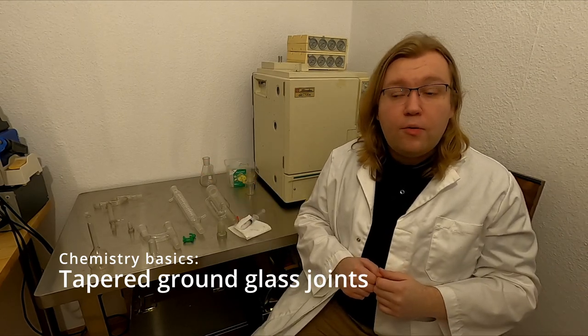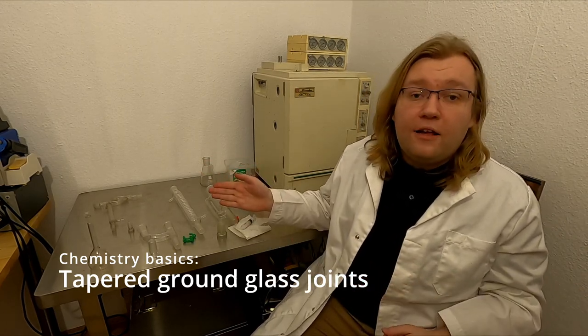Welcome to the chemistry department. Today we will be talking about ground tapered glass joints, commonly found on a variety of lab equipment.